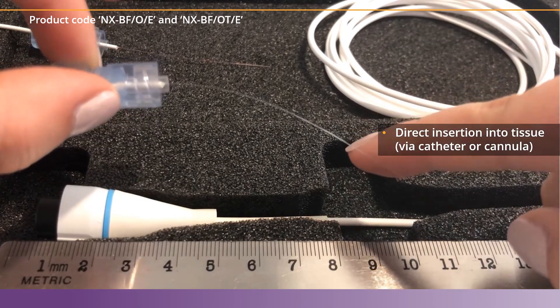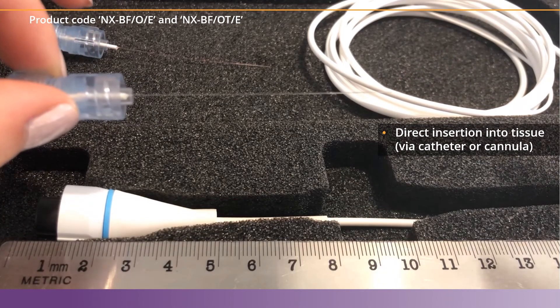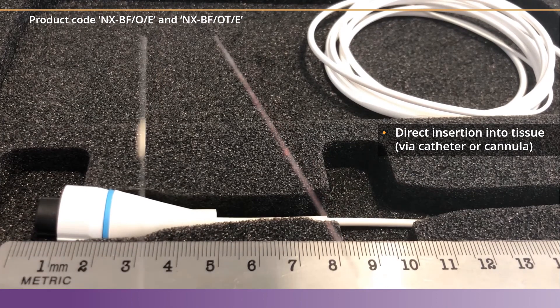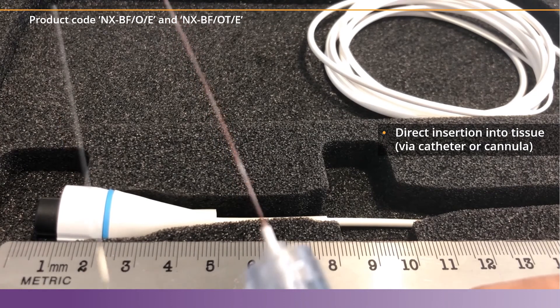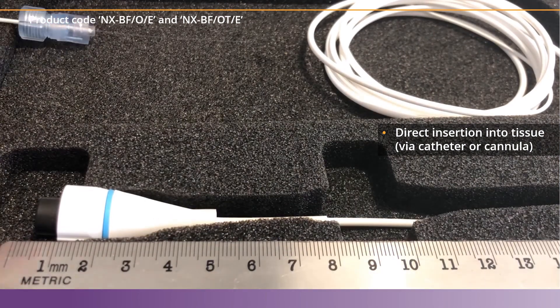When you look at the two sensors side by side, you'll be able to see that the OT sensor has a very thin red thermocouple that's wrapped around the glass fiber. You can see the color differences here just ever so slightly. This thermocouple makes the Oxygen Temperature Sensor slightly larger in diameter than the Oxygen Only Sensor.